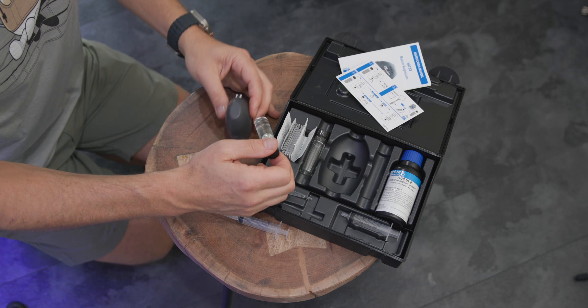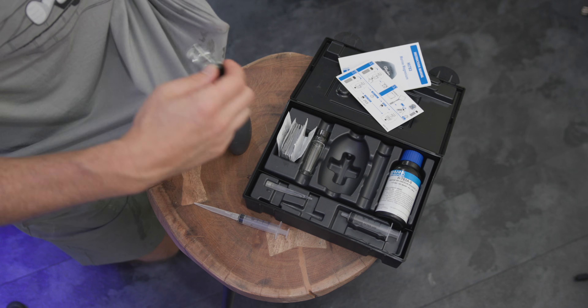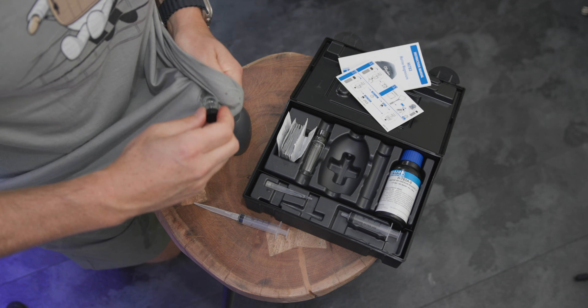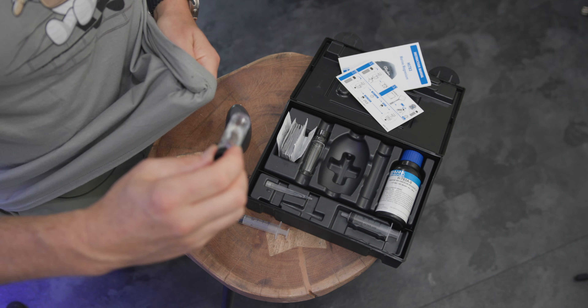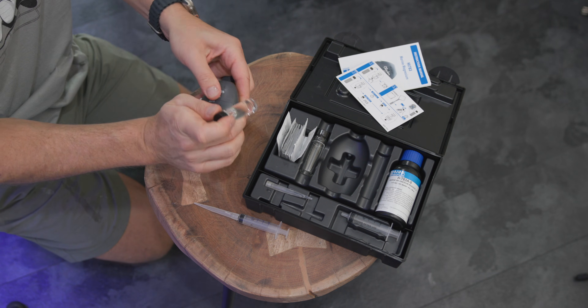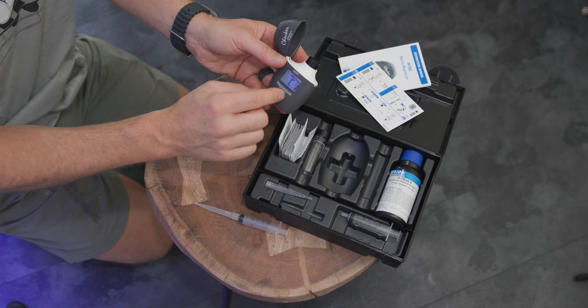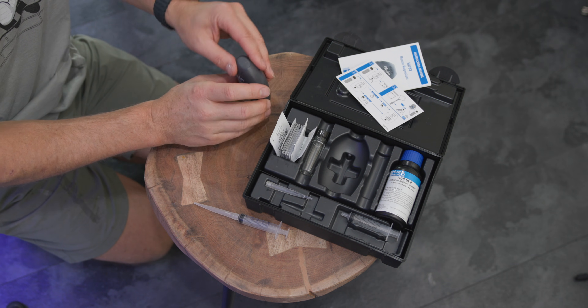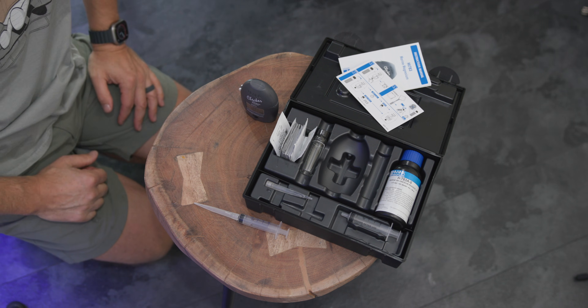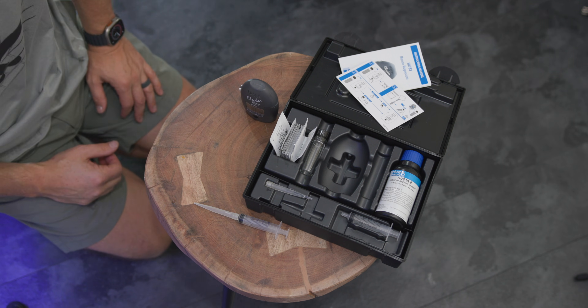Something important: make sure the outside of the cuvette is clean. You can wipe it on your shirt — ideally a lint-free towel, but your shirt works just fine. Put it in the checker, press the button, and it's going to zero out. Don't hold it at an angle; you want to make sure it gets the right zero. Let that go through.